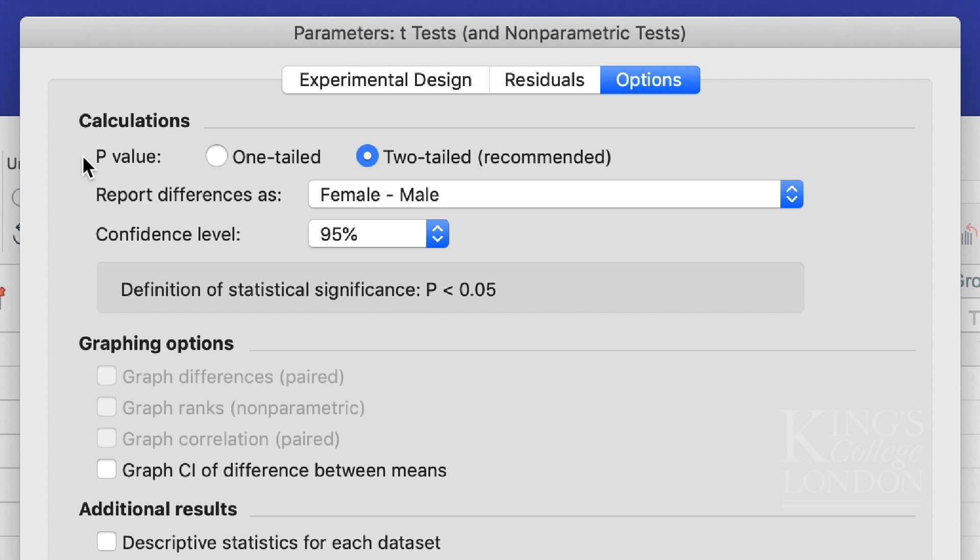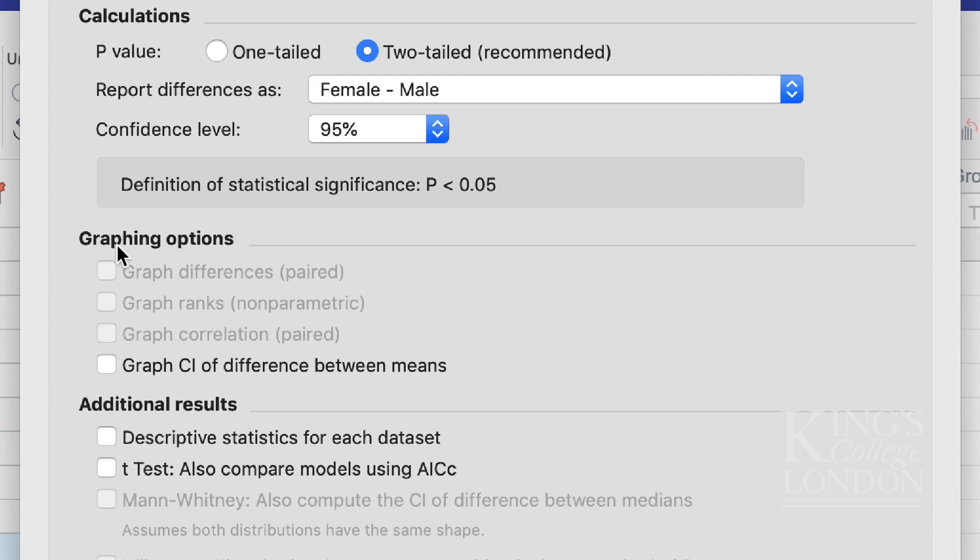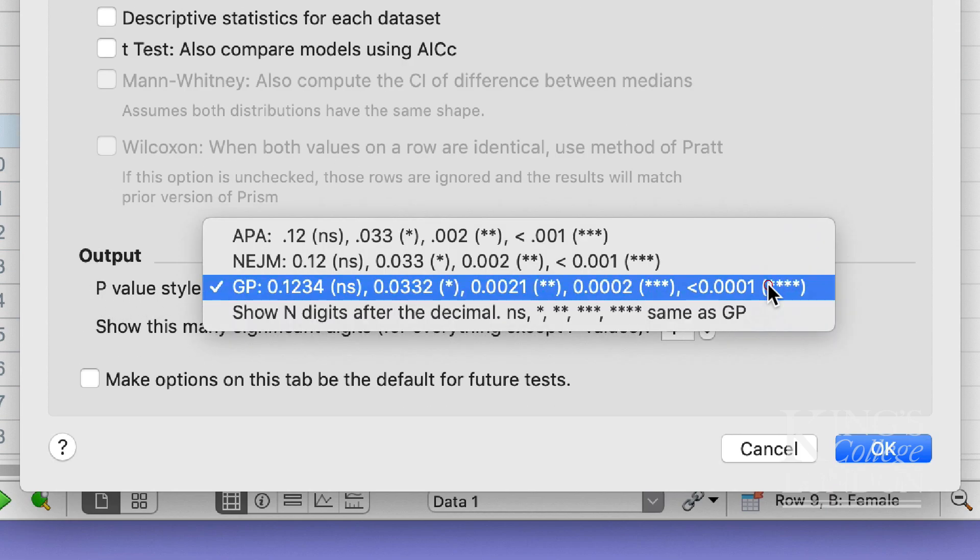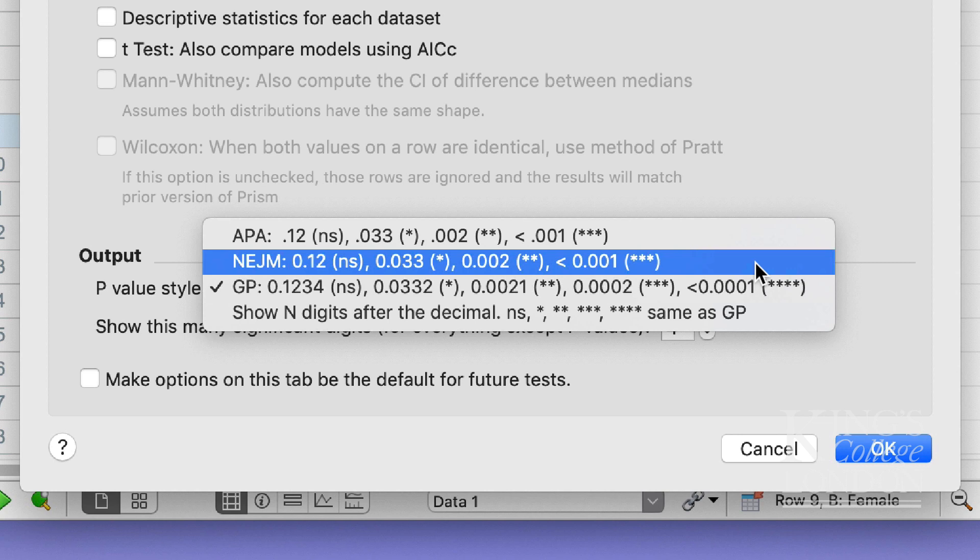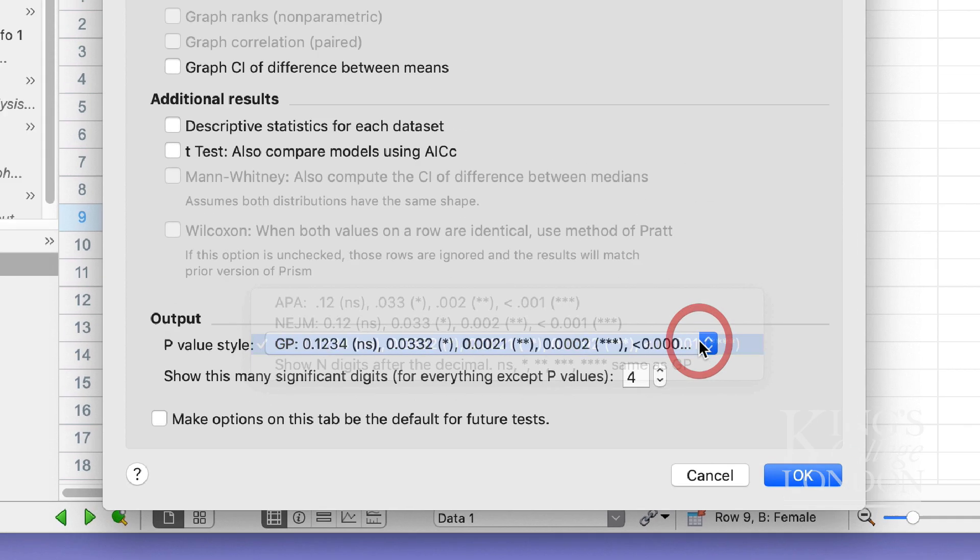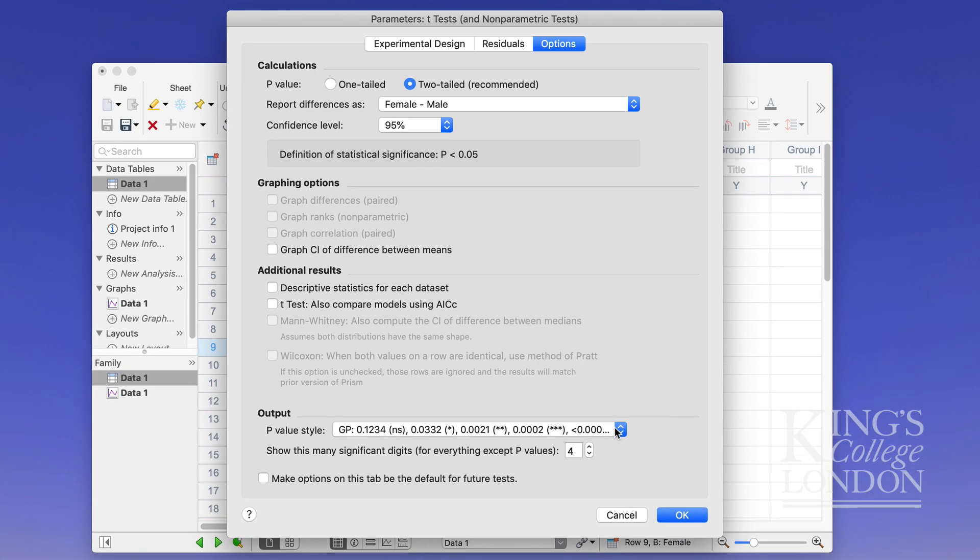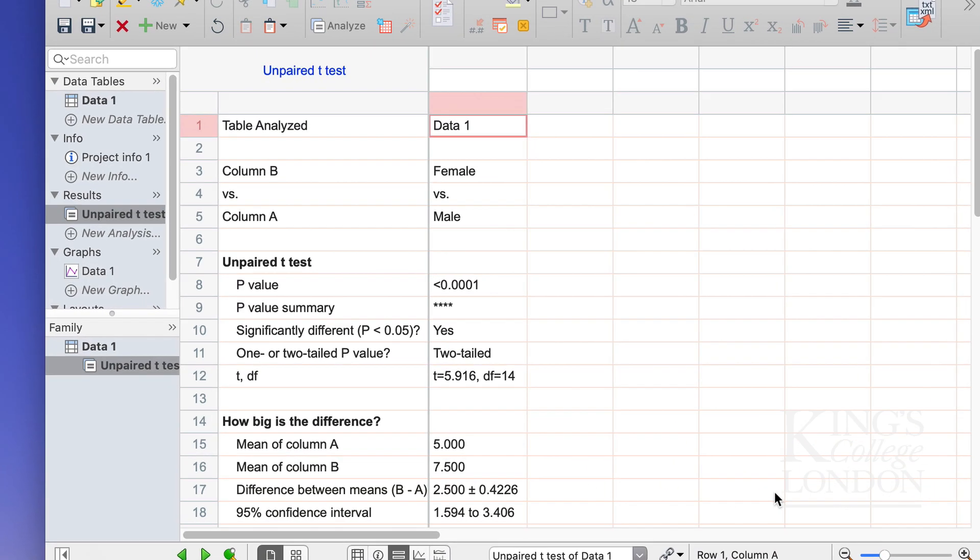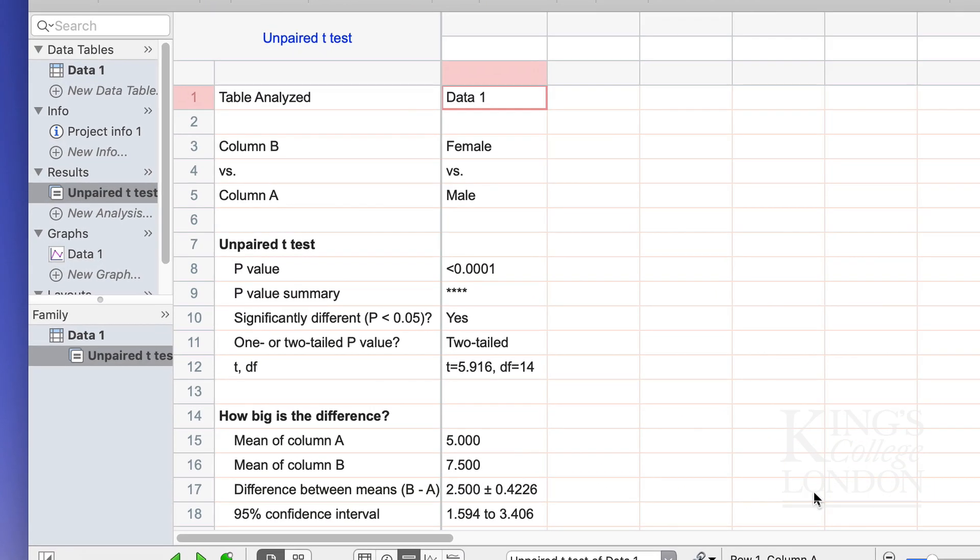I'm not going to choose any other choices here except to point out down the bottom you've got this p-value style where you can choose between different forms. Now I just click on OK and it does my test for me.